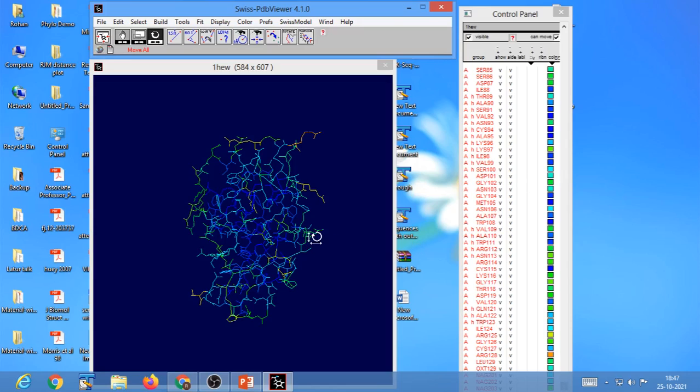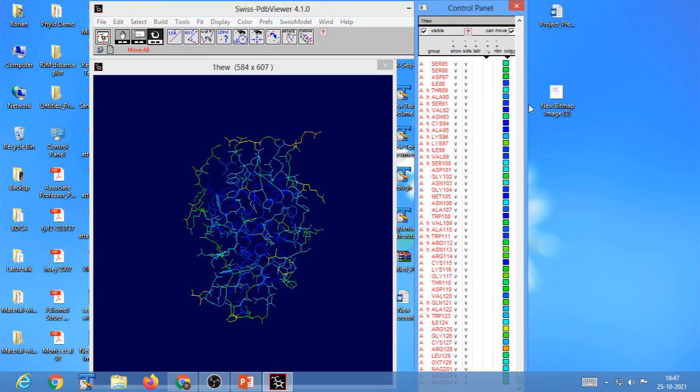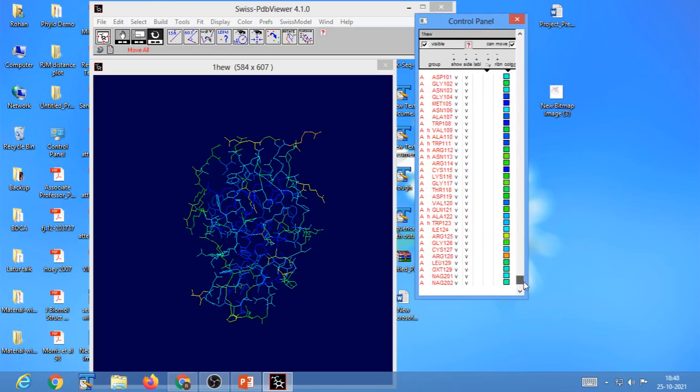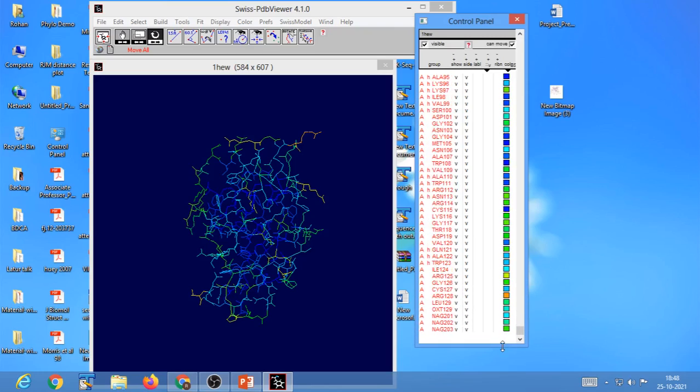Okay, in other words, violet residues are least exposed, while the residues that are at least in the shade of red, as you can see over here, are the residues that are most exposed. Okay, so now let me demonstrate to you the concept of accessibility over here.